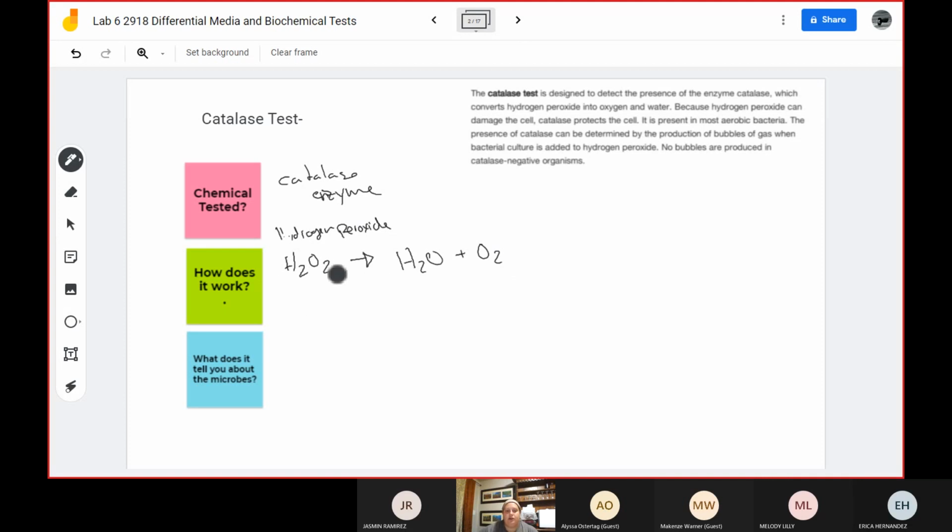So H2O2, hydrogen peroxide, is the same stuff that you guys probably have in your medicine cabinet at home. It's also the same component that you would use when bleaching your hair, or you can also use it if you're getting into doing metal digests to identify heavy metals in samples. You can use hydrogen peroxide to digest metals at various concentrations. The concentration in your cabinet at home is pretty low concentration. I think it's at 3% usually.